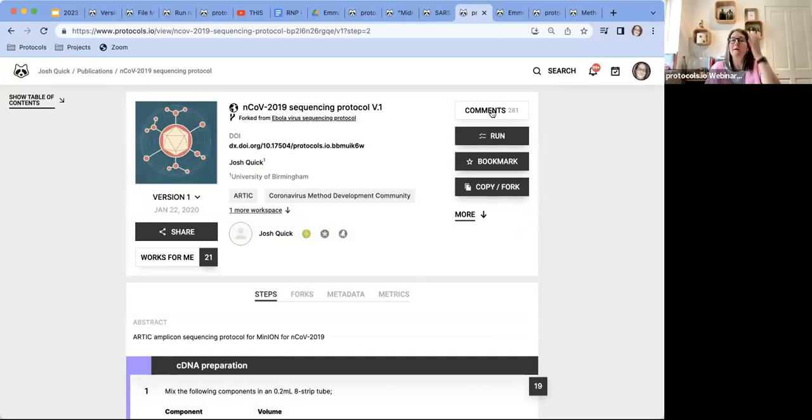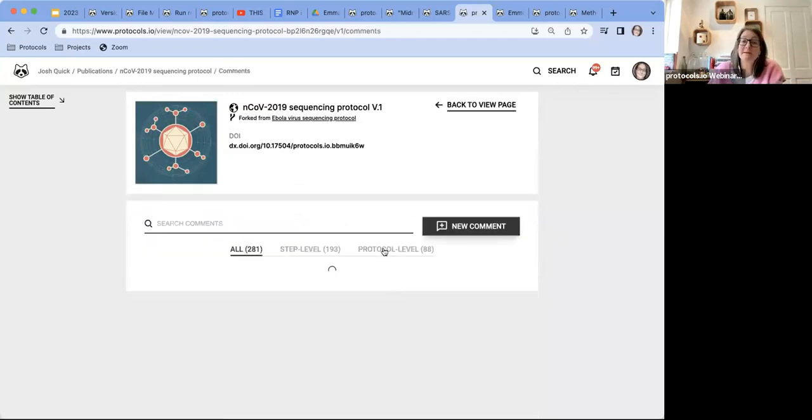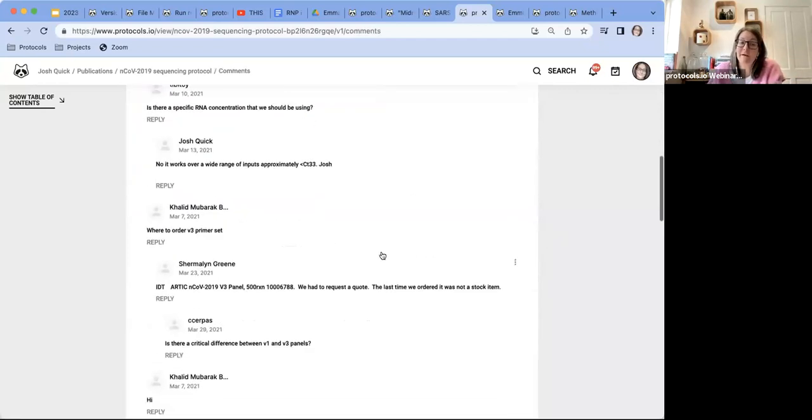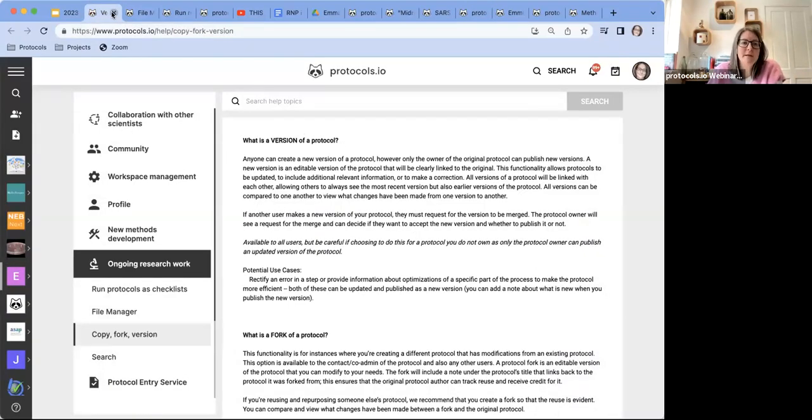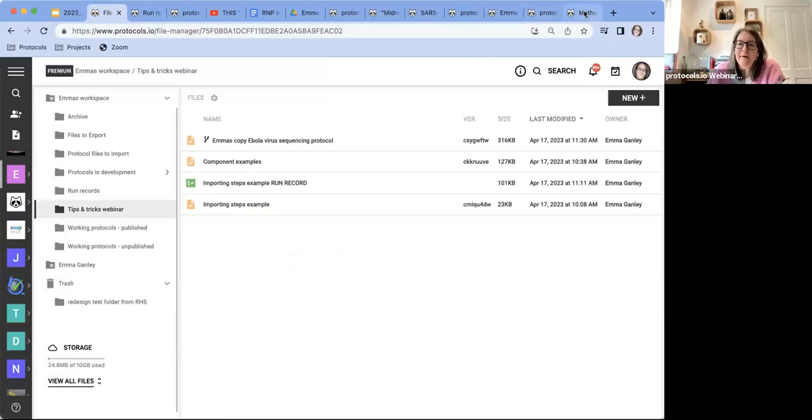So rather than emailing an author of something and having a private correspondence, there's essentially this massive live FAQ of information that helps others know how to use those protocols. The next thing down is collections. So we don't need that one. I had opened a collection.